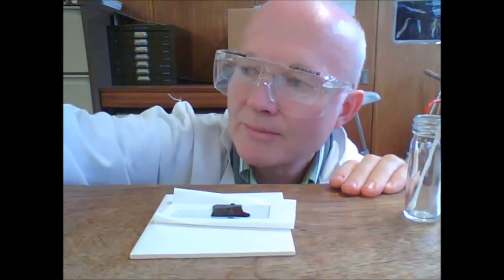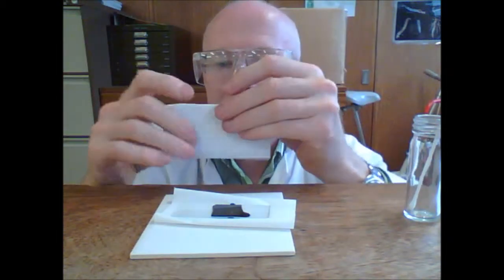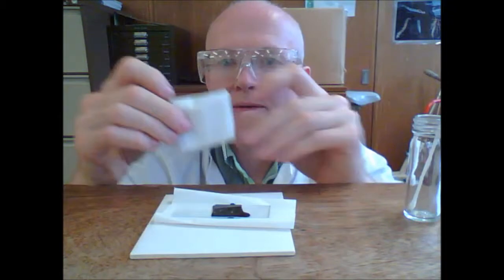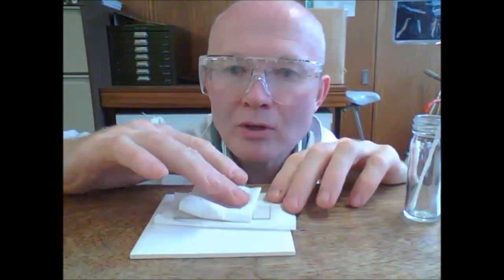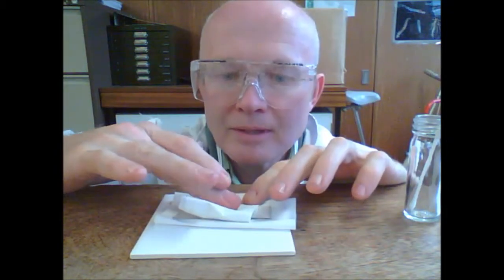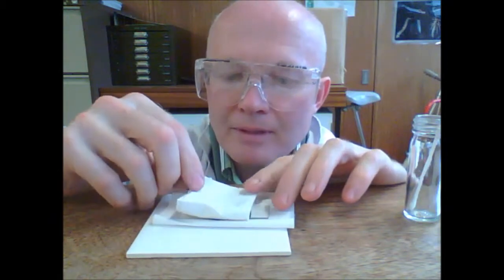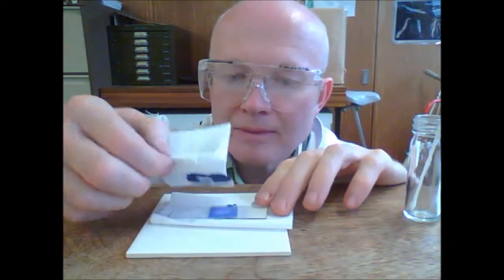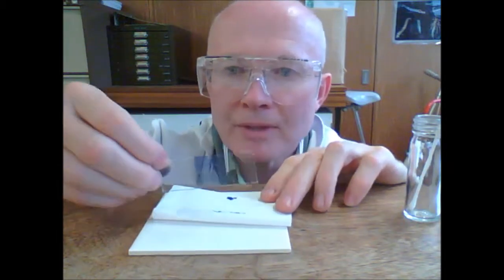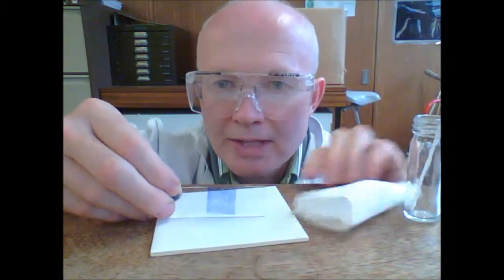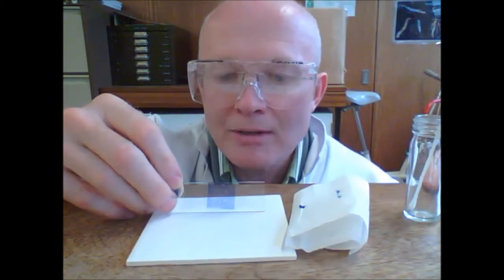Take another tissue, and you can fold that into fours, to quarters, and then blot from above. Don't be frightened, blot quite firmly, because you're looking for quite a thin layer of stain. So blot it firmly, put that in the bin, and then you've got a light blue stained slide ready for examination under the microscope.